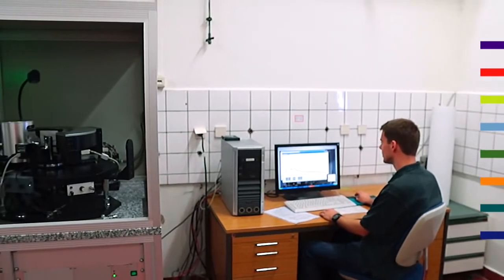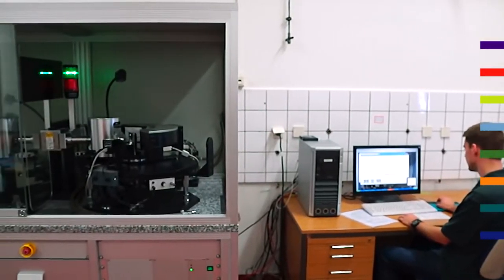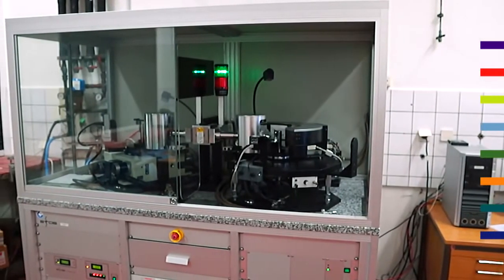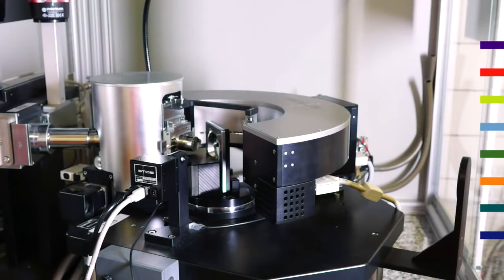Working with ionizing radiation and radioactive compounds requires special instruction by the radiation safety officer, my dear Smithy. Such work must only be performed at specially designated workplaces. You must limit exposure by employing technological measures to keep exposure as low as possible. Handling ionizing radiation and radioactive chemicals is regulated by the Radiation Protection Ordinance. The principal rule is, everything is forbidden unless you have special permission.